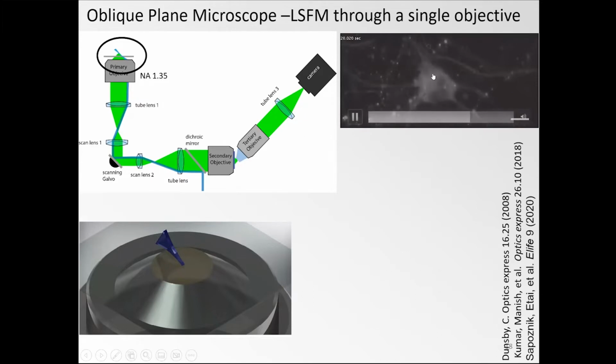But here, for example, this volumetric imaging, this is a 10 micron scale bar at 13 hertz of a neuron labeled with GCaMP. So you can really make this fly. If you were sample scanning, say in a lattice, I'm not sure if you can go over 10 hertz. You would surely start to wobble things.